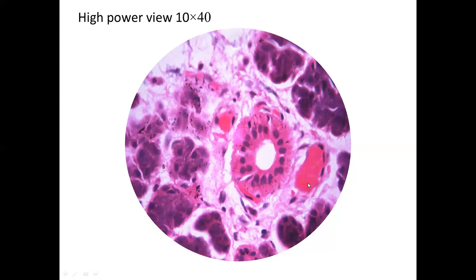Here you see a duct, a blood vessel, acini, and collagen fibers at magnification 10x40. In the high power view of the salivary gland, the duct shows pink-stained cytoplasm with nicely rounded purple-stained nuclei and a clear lumen. The acini now show clearly visible central darkly stained nuclei and pink cytoplasm — though because of proteinaceous granules inside the cytoplasm, the acinar cells appear darkly stained in purple. You can also see blood vessels with squamous cells and red blood cells inside, and collagen fibers.